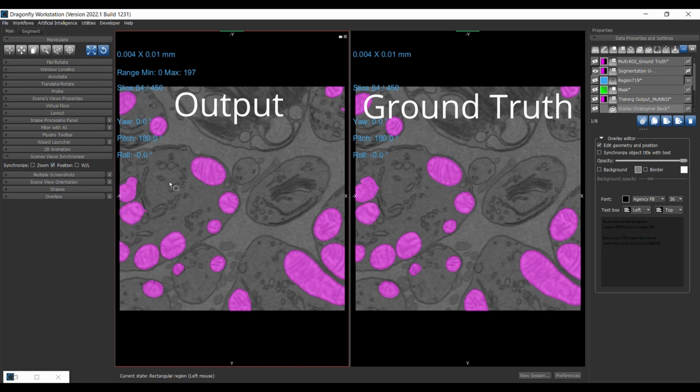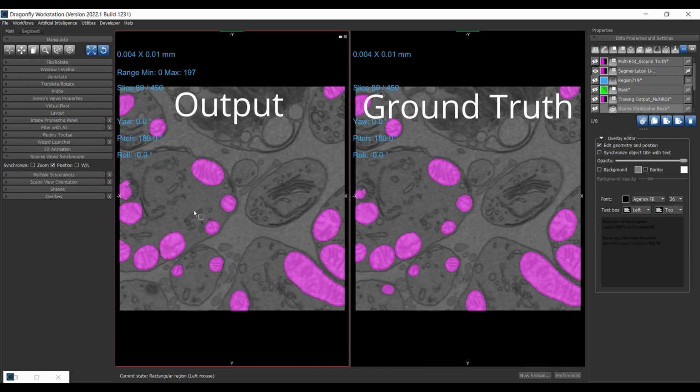So it did a perfect job. I'm pretty much satisfied with this segmentation. See, this is our ground truth segmentation. This is the segmentation that we received from our U-Net. It's a nice result. Only if you look here, you see some misclassification. Even though the result is not perfect, it did a much better job than other classical image segmentation algorithms.